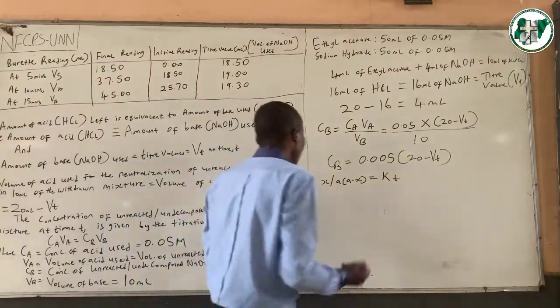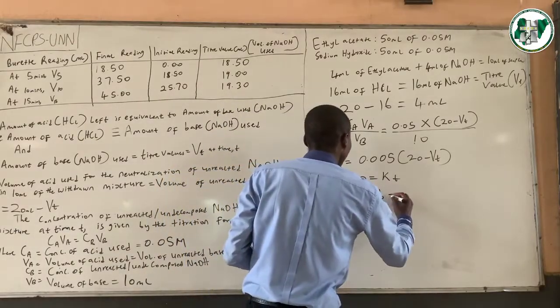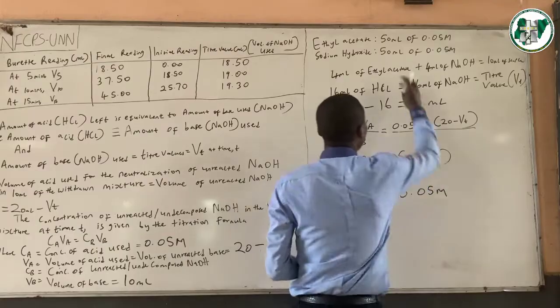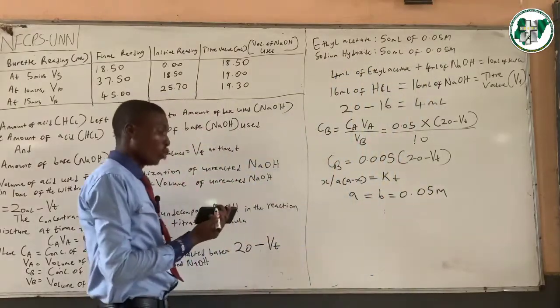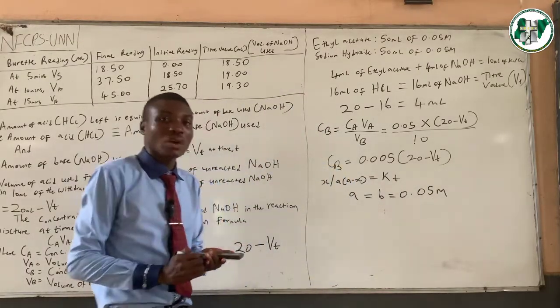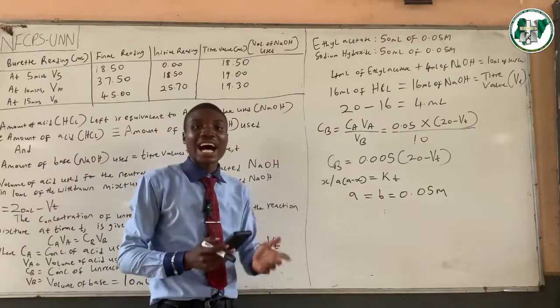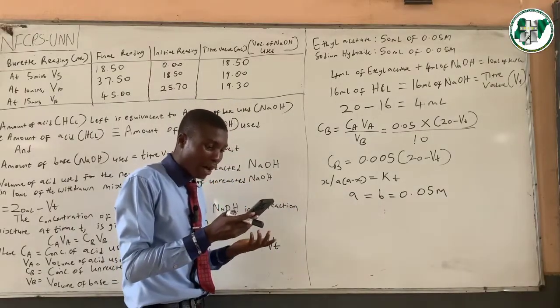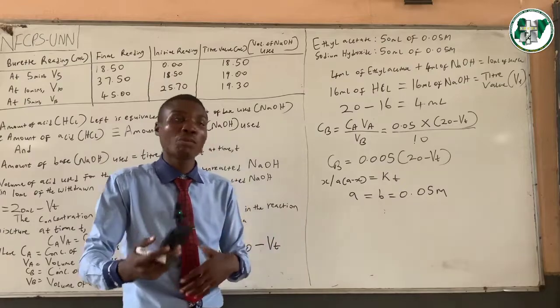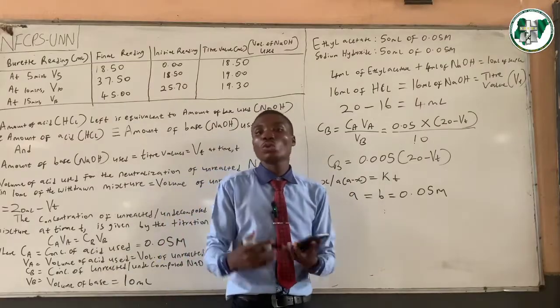If we know that the concentration of the ethyl acetate, which is A, is equal to the concentration of the sodium hydroxide, which is B, then we know that these two values are the same thing as 0.05 molar, as we have already determined here, because this is ethyl acetate A and sodium hydroxide is the B. So we already know that this is the amount that was there initially. Now the next question is, how do we get x? x simply refers to the amount that has decomposed, the concentration of the base or the ethyl acetate that has been decomposed, because it's a 1:1 reaction. If you know the amount that has not been decomposed, you can know the amount that has been decomposed.